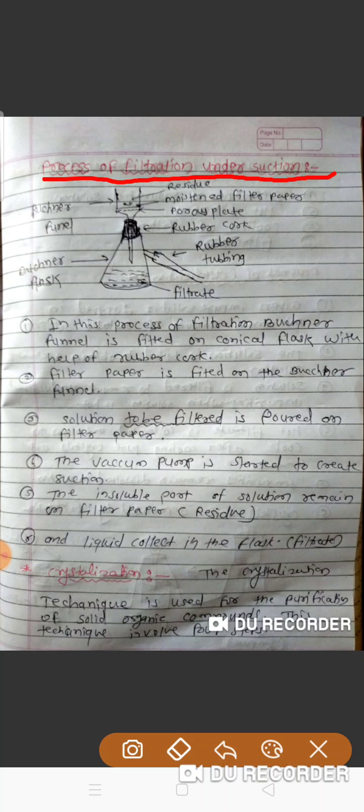See the first diagram. This is the Buckner flask. This is the rubber tubing, the side rubber tubing. This is the Buckner funnel. The Buckner funnel is fitted to the Buckner flask with the rubber cork. The Buckner funnel has a porous plate, and above the porous plate, the filter paper is fitted.